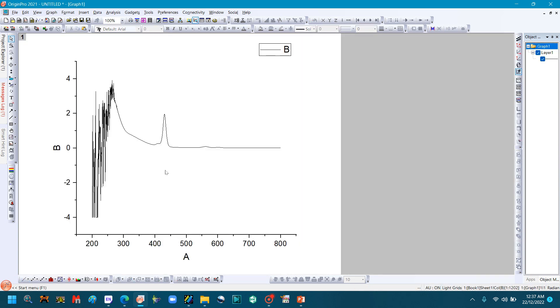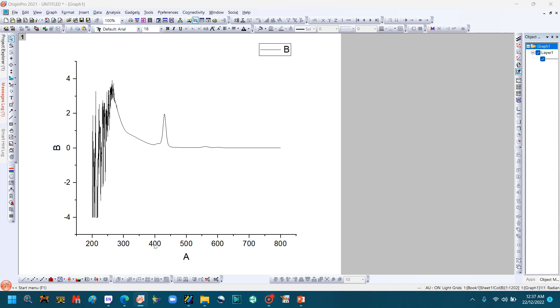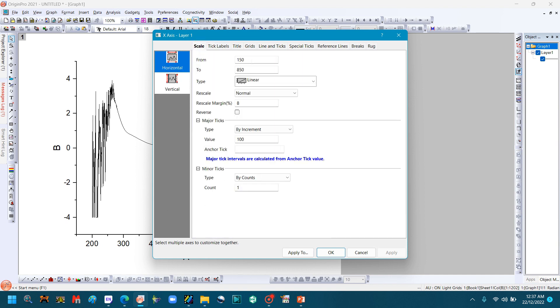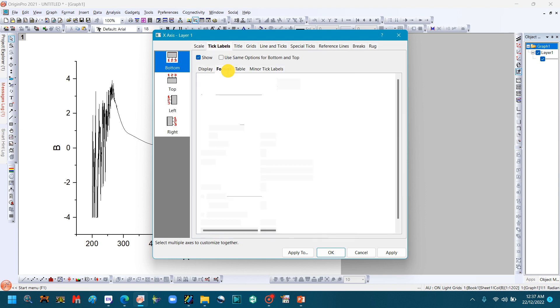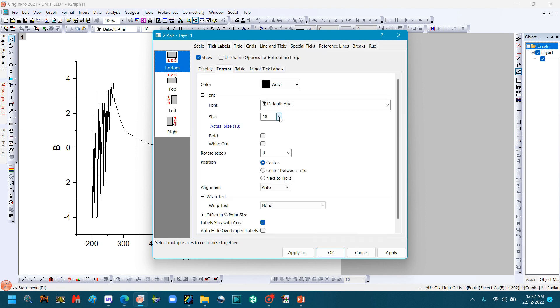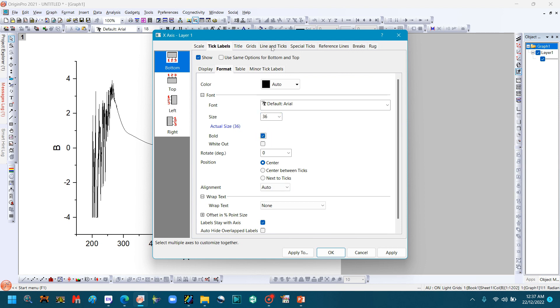You can edit the graph according to your choice. Double-click the x-axis to change it. Go to Labels, then Format, and change the font size. You can also change the font style here. Size 36 is good for articles, but you can also change the size. Click Bold, then go to Line and Ticks.